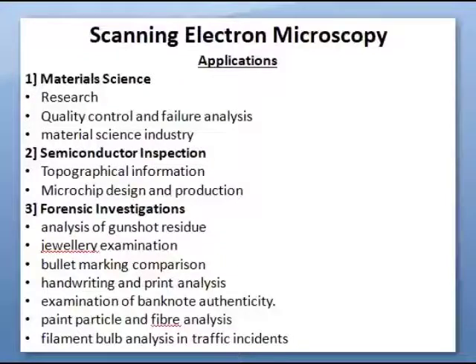Hello everyone. In the previous class we discussed the scanning electron microscope as well as the optical microscope. These are characterization techniques. Today we'll continue with scanning electron microscope applications as well as limitations before we go on to the next topic.